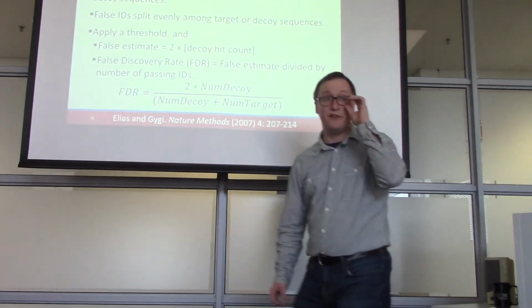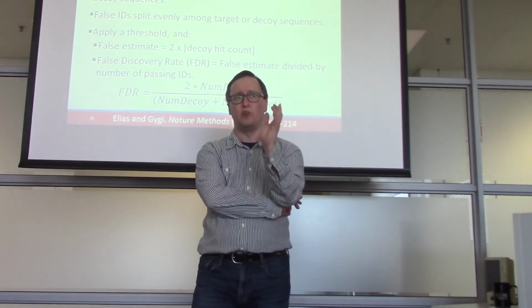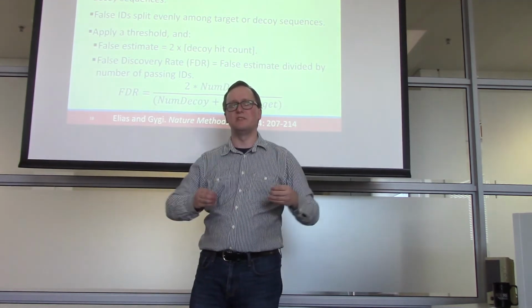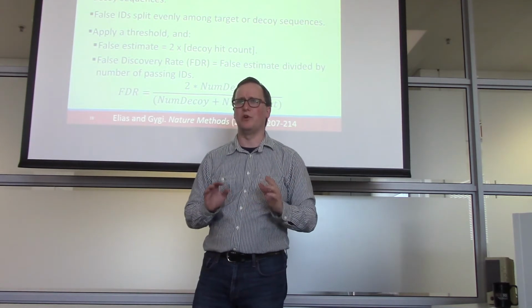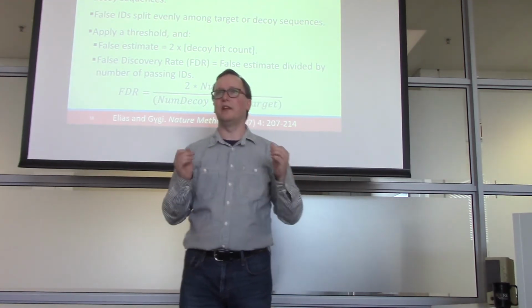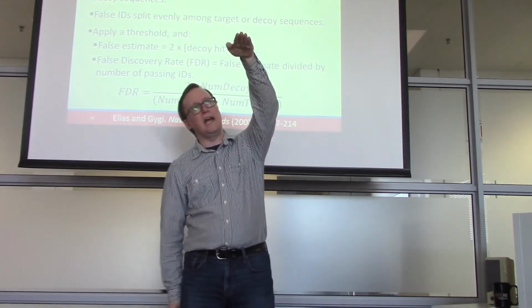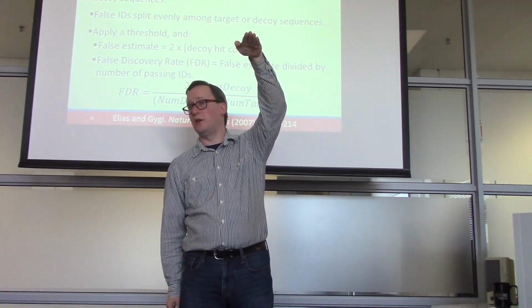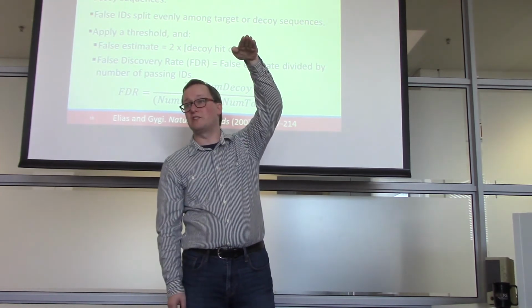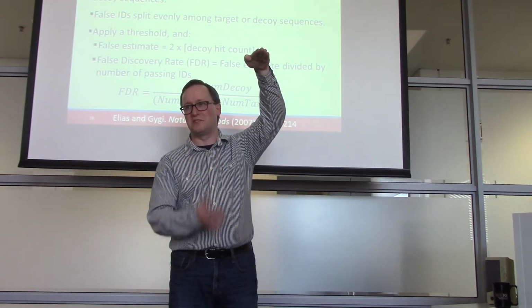Now, a lot of people find that very hard to deal with. So I'm going to talk about the target-decoy method because an awful lot of people make use of this. And there are some ways that you can game the system so that you get false results out of target-decoy. But in general, when people are just using it for protein ID stuff, they come up with pretty sensible numbers. So I want you to imagine that I have sorted all of the spectra from this file beneath my hand. This one at the top got a really great score. This one down on the floor is obviously palpably false, right?